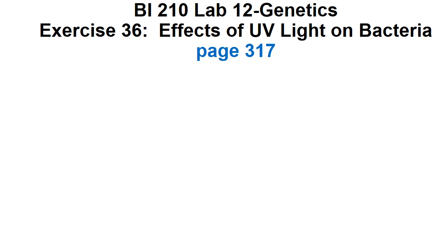Welcome to Biology 210, Lab 12 Genetics, Part 2. We will begin with exercise 36, the effects of UV light on bacterial growth. This is on page 317 of your lab manual.